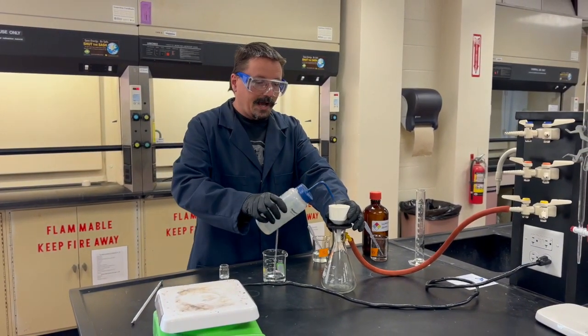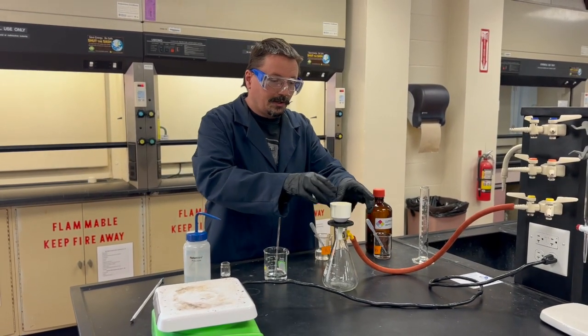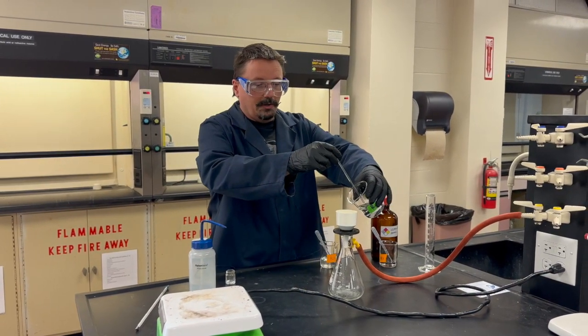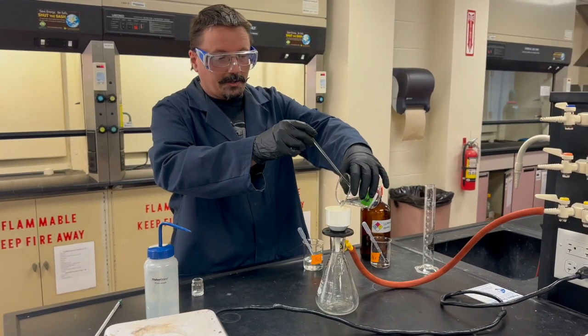When you're ready, bring your setup and set the filter paper in the Buchner funnel. You can add a little water to get it to stick down flat. Then slowly pour your solution through and you should see clear water coming through.